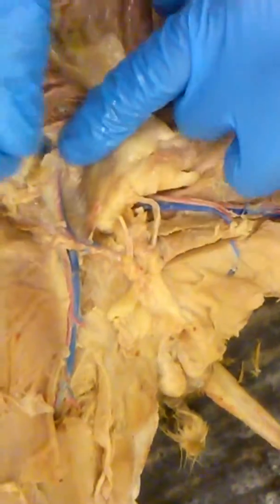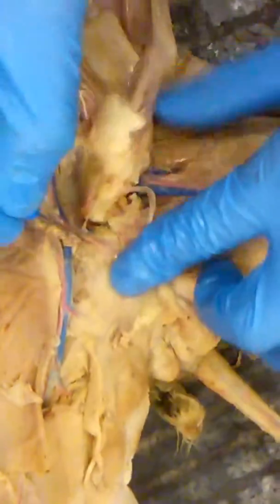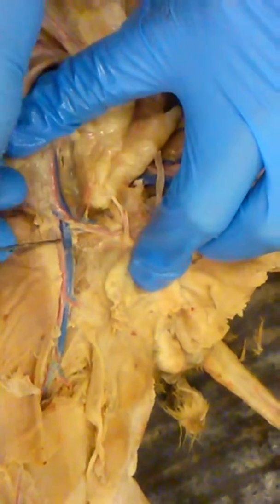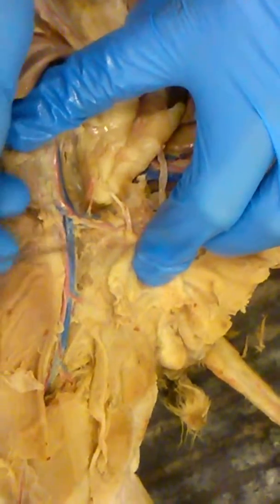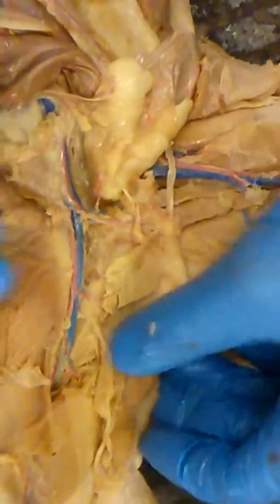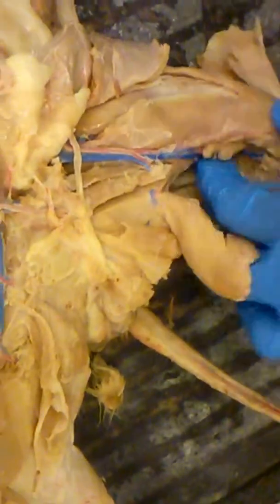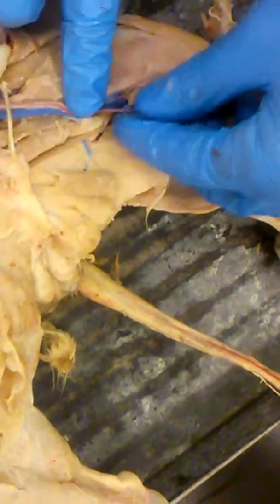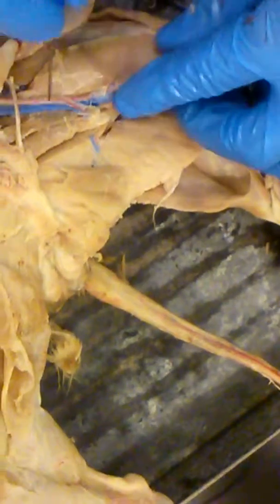Where is it going to go to the tail? Right here, I think it would be your internals, but you're going to have to know them. So here are your externals, and then the external iliac vein. I forget how the saphenous and the femoral are lined up. It's on the outside part of the outside, and it hooks. So there's the great saphenous, would be right there. And then the femoral is right here, running down.